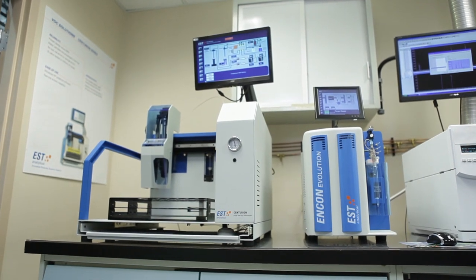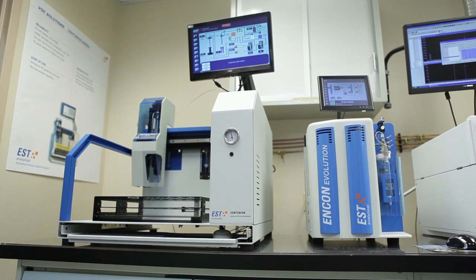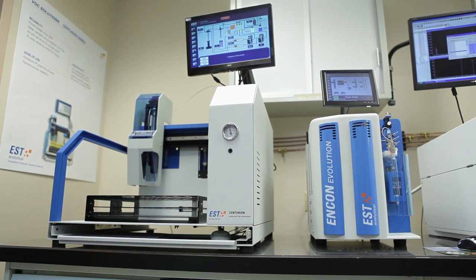Today we would like to take you through some of the features of the Centurion water soil auto sampler and the ENCON Evolution purge and trap concentrator.